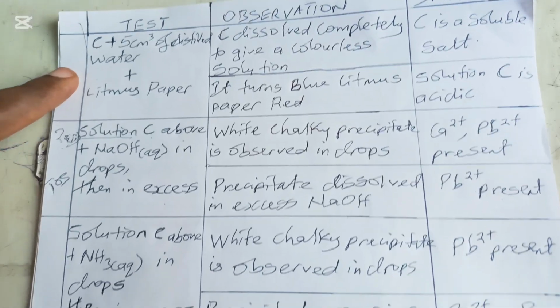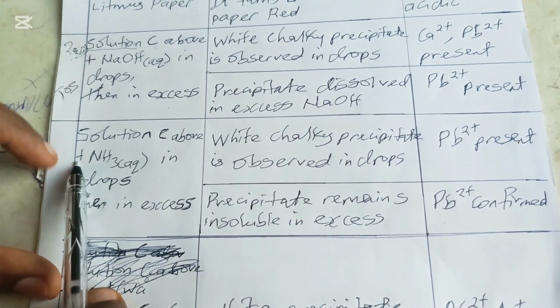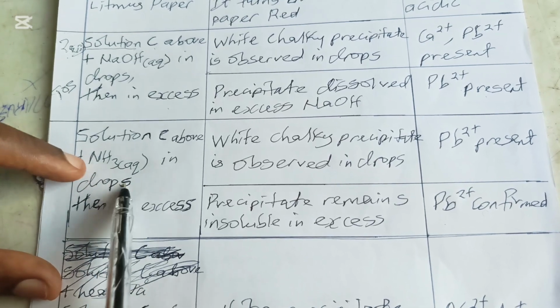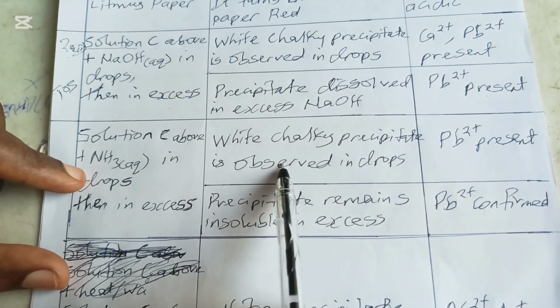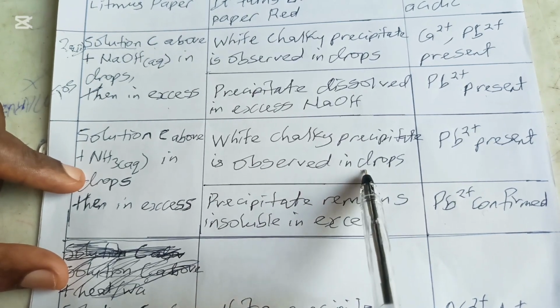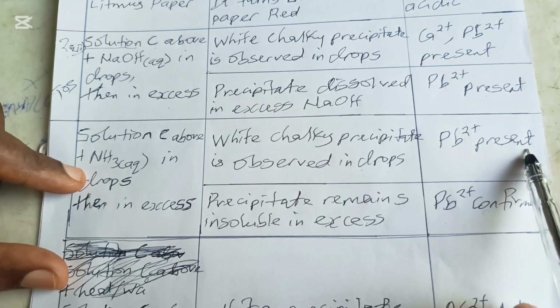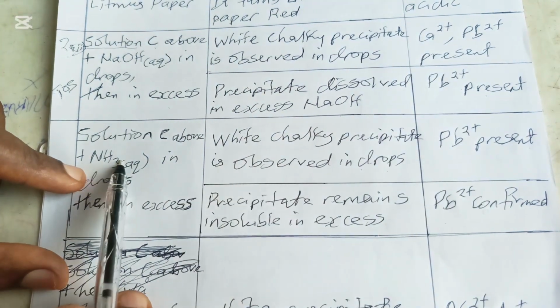They might also say solution C above, you should now continue to add aqueous ammonia in drops also. You still get the same color. White chalky precipitate is observed in drops. Pb2+ is present, because calcium will not even give any reaction to aqueous ammonia.